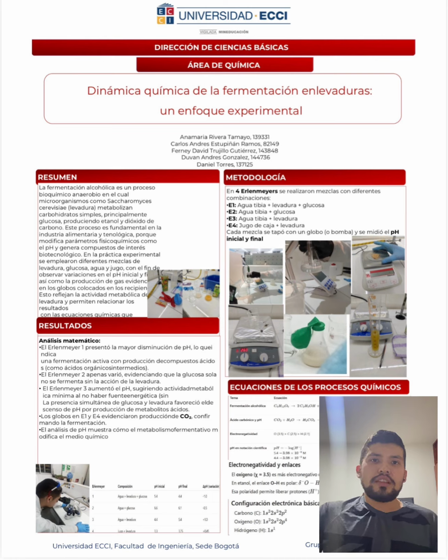Now, let's look at the results. In E1, we observed a decrease in pH. This means that active fermentation occurred, producing ethanol, carbon dioxide, and also intermediate organic acids that lower the pH. The balloon in this flask inflated, confirming gas production.